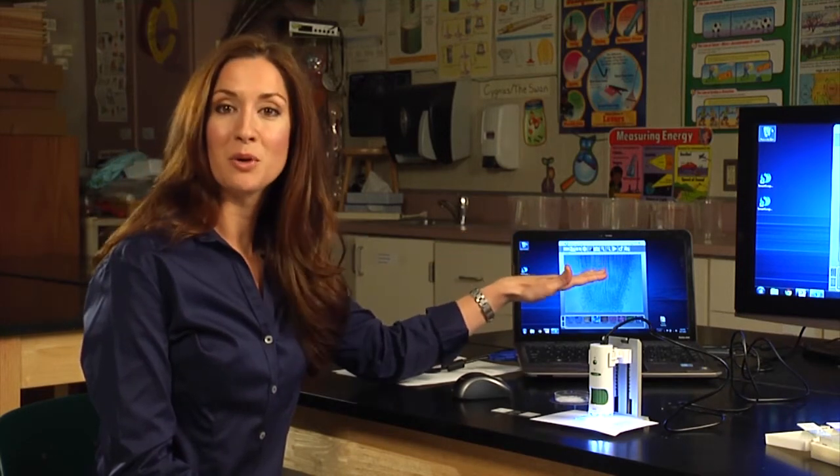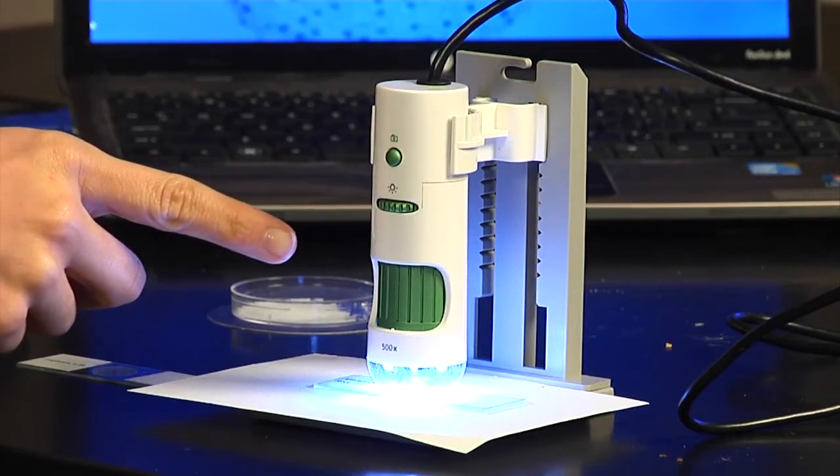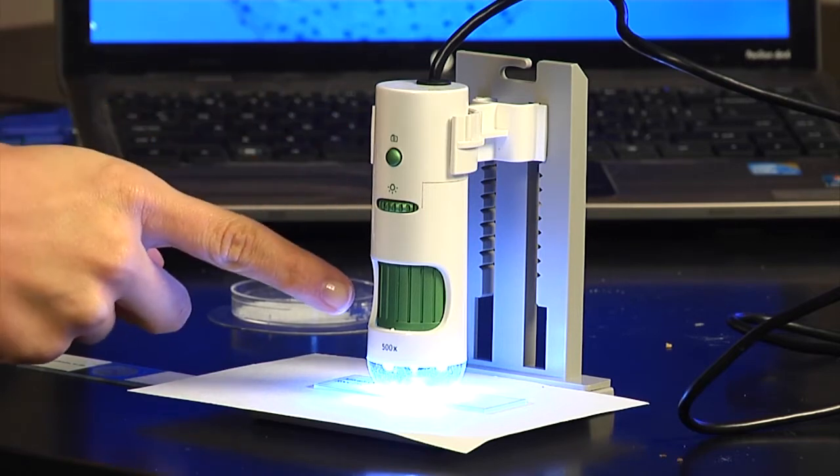You can hook the SmartScope right up to your own computer and then project the images throughout the classroom, whether that's on the screen or an interactive whiteboard. The SmartScope 500 is extremely easy to use. You have three controls all on the front: the camera, the light dial, and the focus dial.